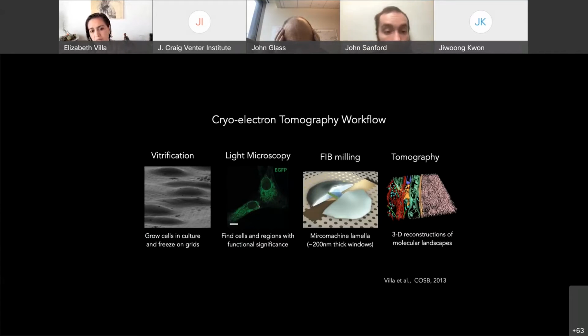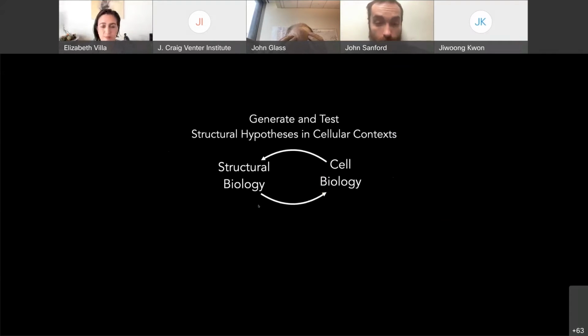And then we can combine this with fluorescence microscopy and then a technique called cryo-FIB milling to try to make cells thinner, because basically, to be fair, the only type of cells that we can observe directly are cells that are about 300 nanometers. So basically, this 3A and a handful of others. And eventually we do this sort of tomography.